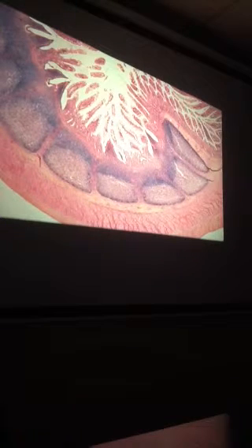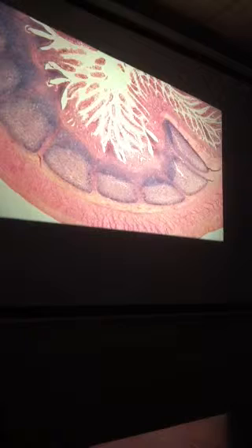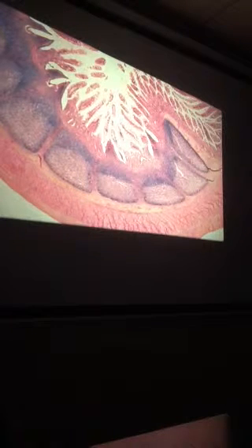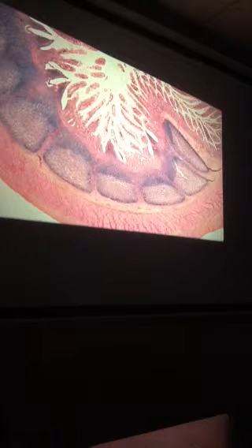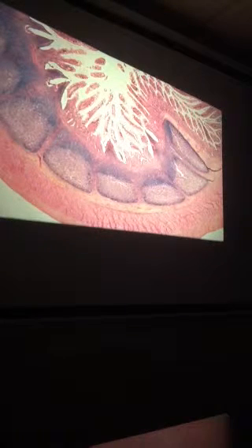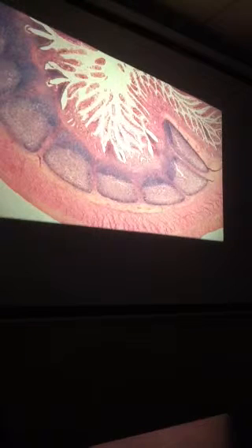A pleat, and now these are the villi, the trees on the hill. All right? Even though a node is nestled up against it, it's still a plica. So it runs throughout the small intestine. But here, you see Peyer's, gotta be ileum. That's the main identification.